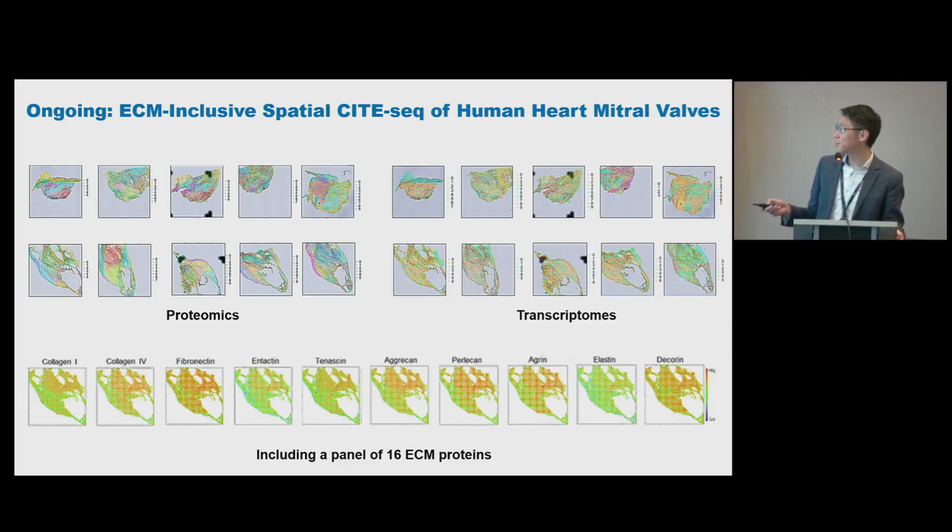And the unsupervised clustering based on proteins and based on transcriptome gives you more or less identical clusters, which is great. It's a good validation. And then the power of high-plex proteomics: when we used a very small panel, unless you carefully pick the proteins you want to put into that panel, we found it is not possible to use the proteins alone to do unsupervised clustering. But once you get to 300, you get a somewhat unbiased global analysis.